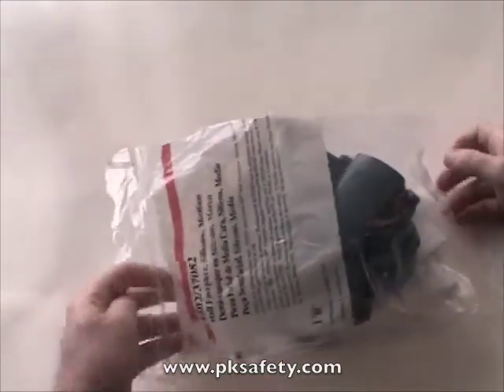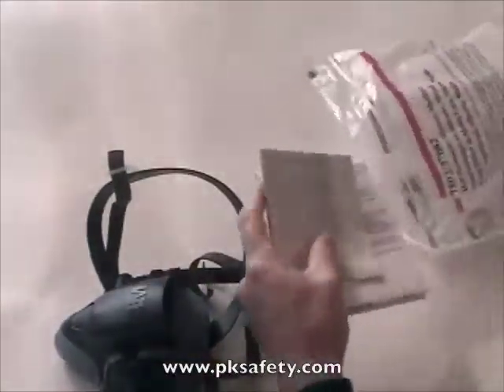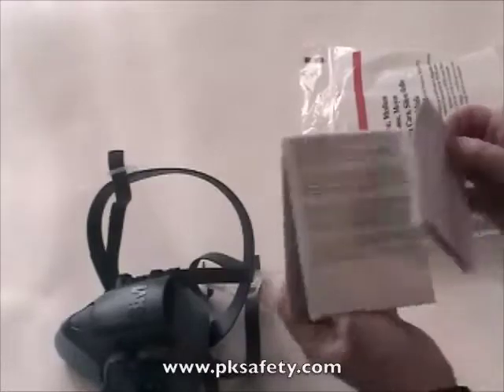It comes in a zipper lock bag. You get the mask itself, directions, part numbers, that sort of thing.